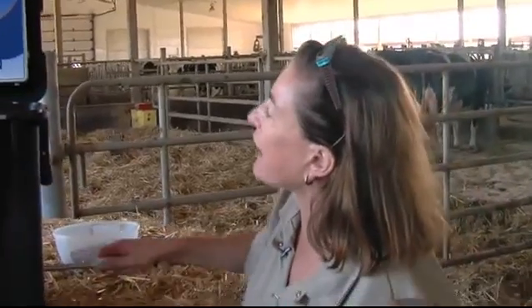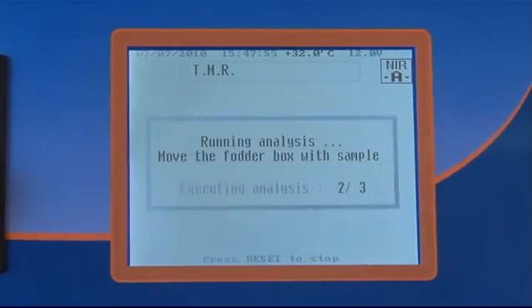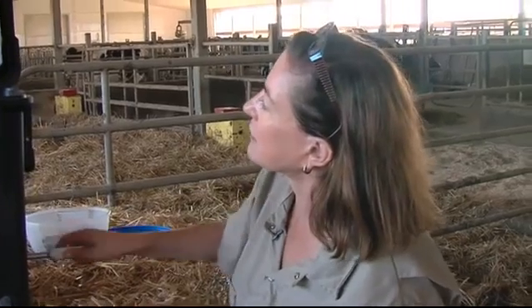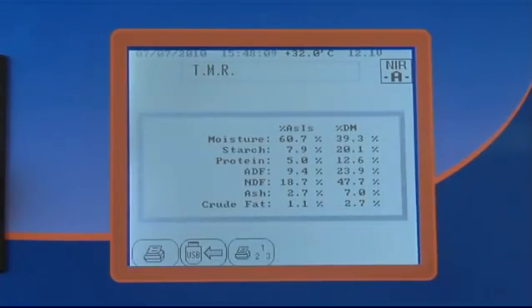We're doing three samples, three analyses that will be averaged. I now have got my analysis.